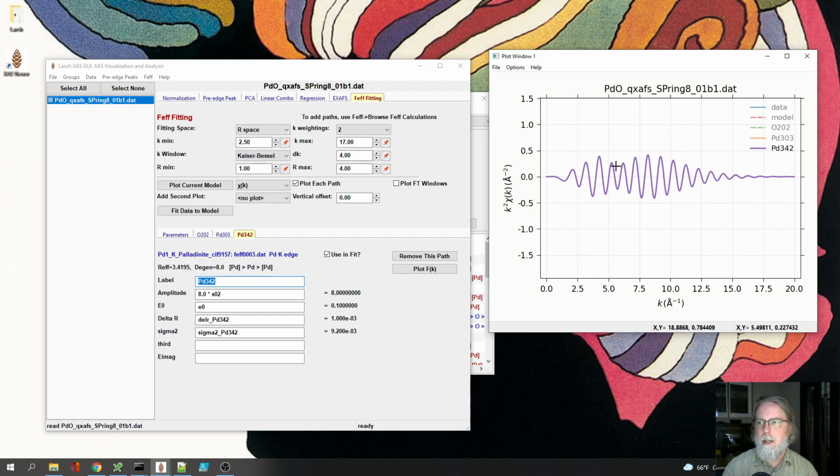So that is just the amplitude function wrapping those oscillations. Each of them has it. And then in addition, because they are different distances, they will go in and out of phase and so have a beat to them. So the palladium scattering in this spectrum is pretty complicated. The oxygen seems much less complicated in contrast.